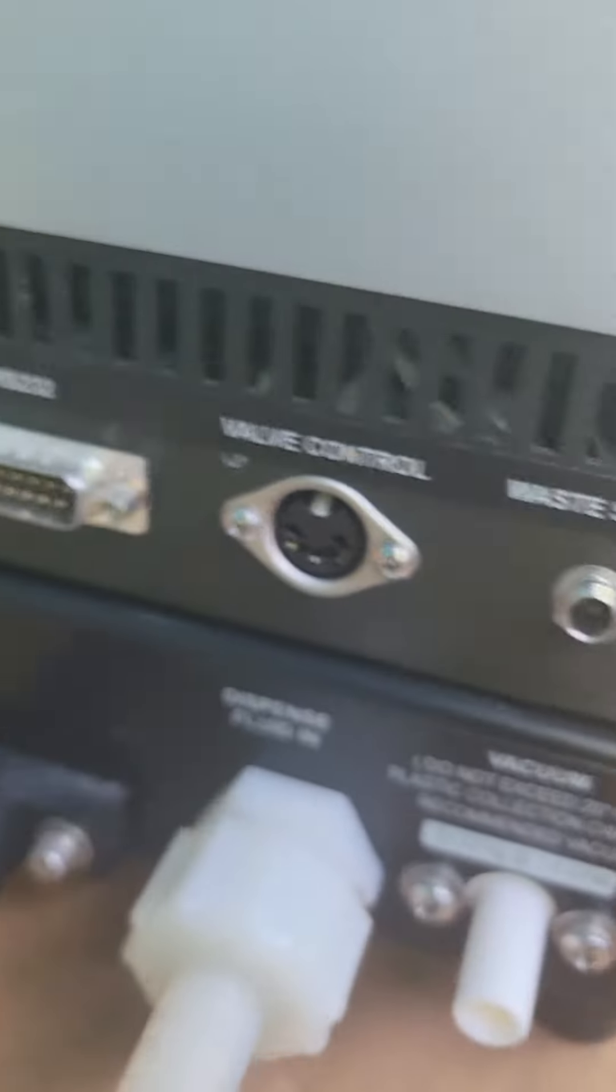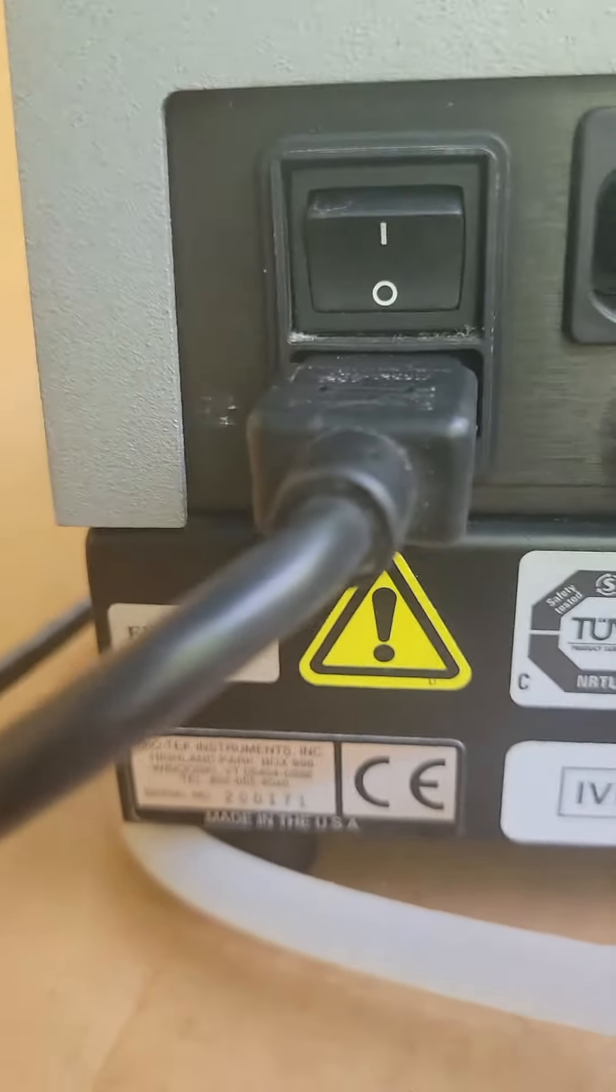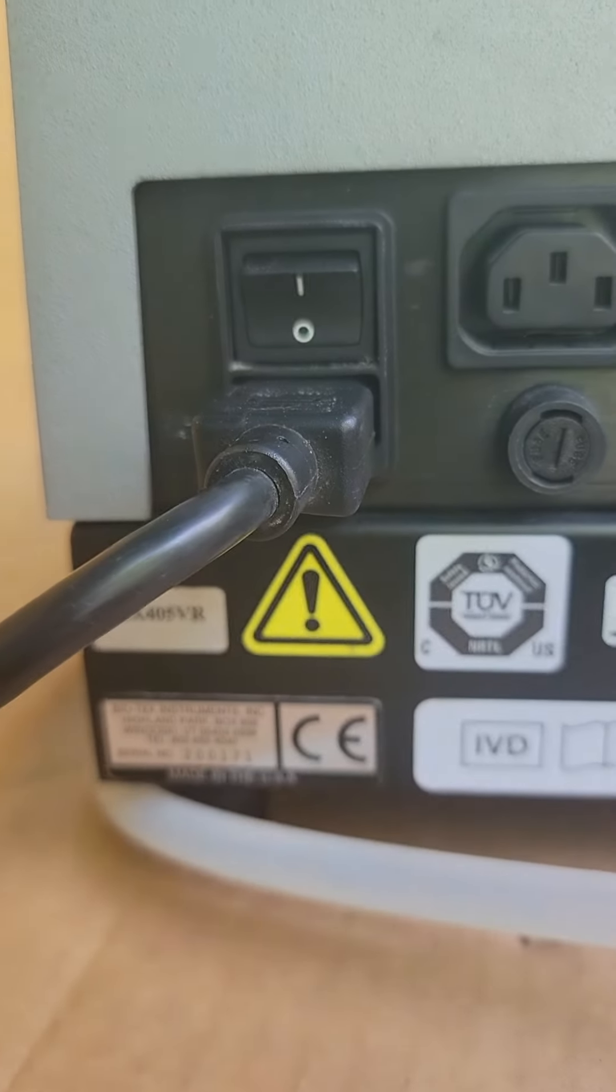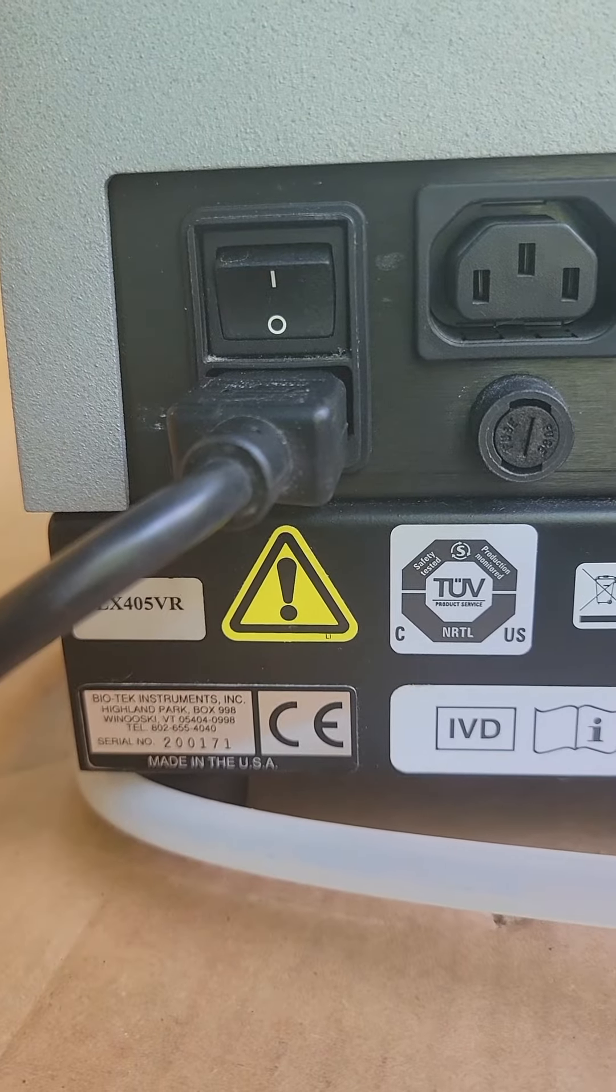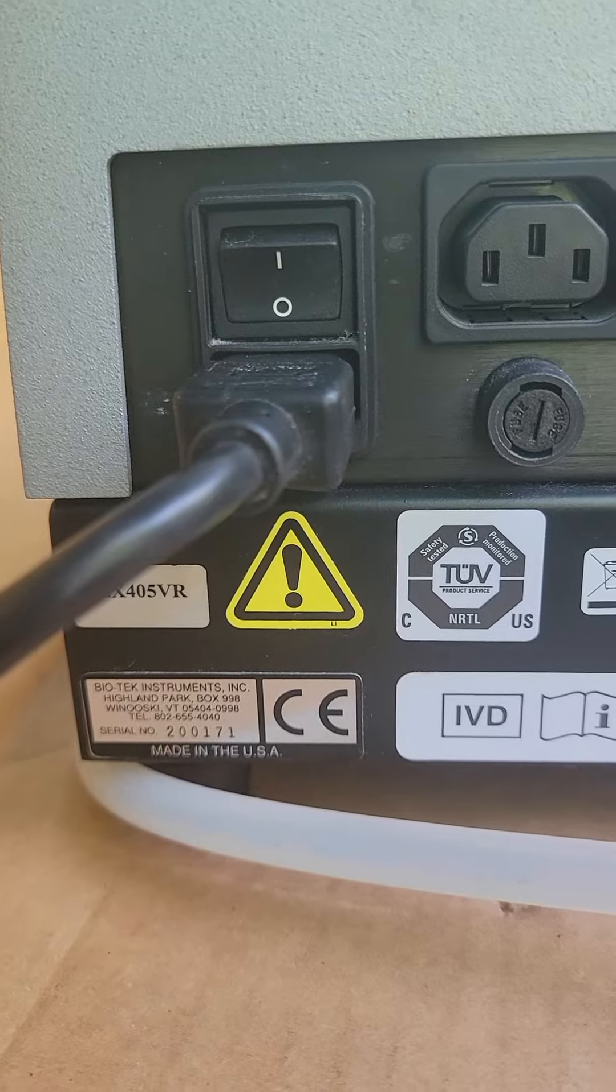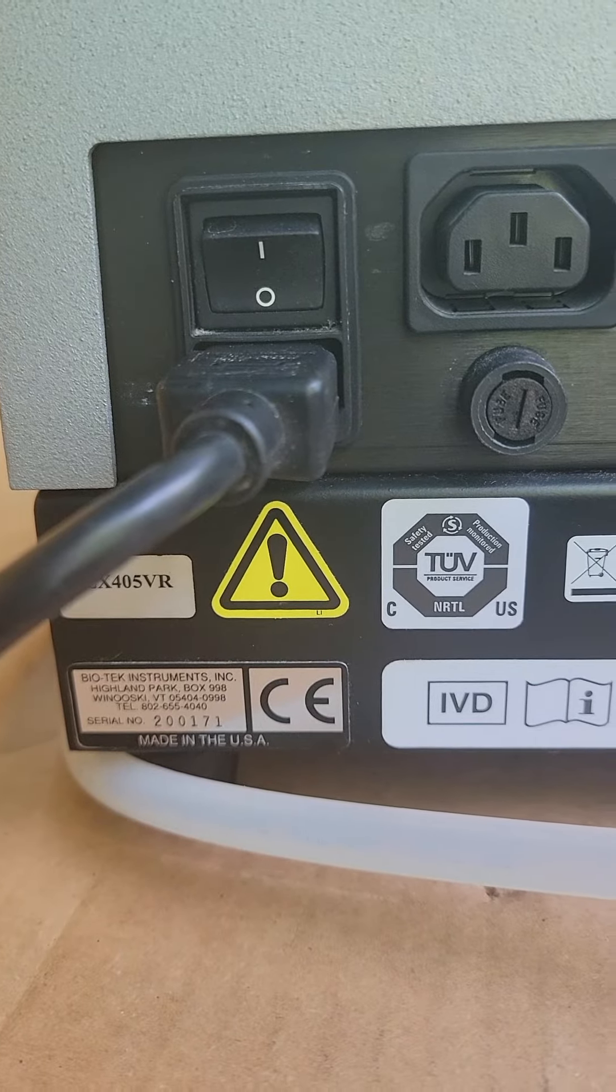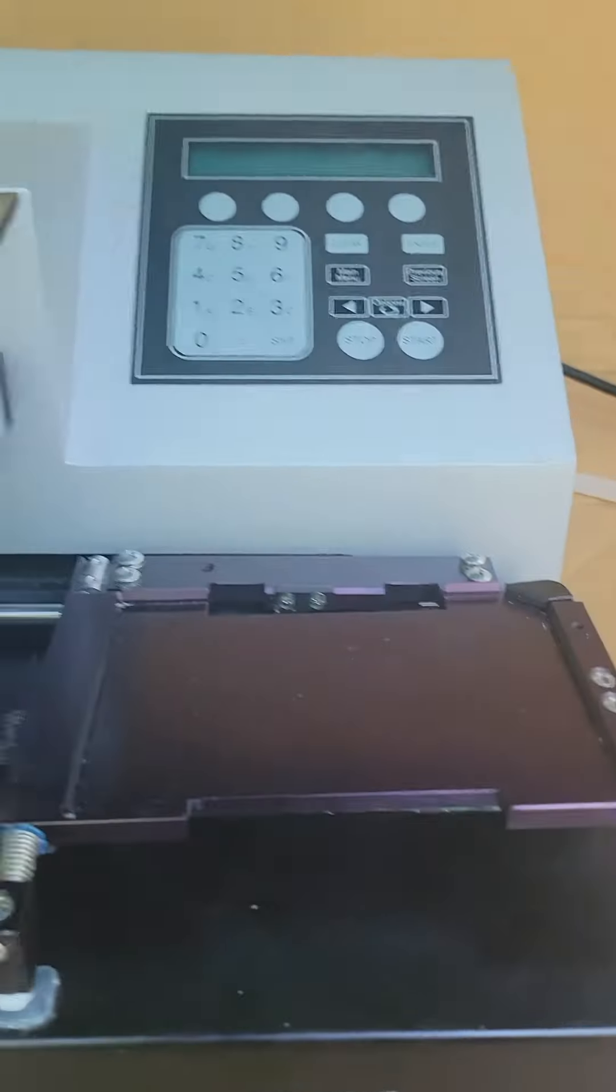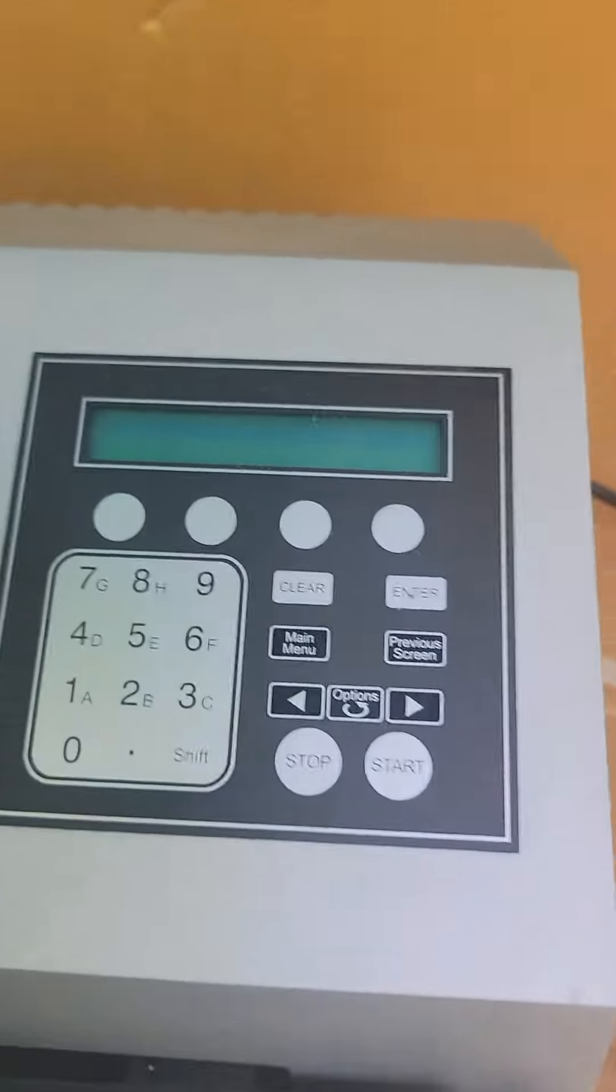And this unit does power up and does work very nicely as well, as you can see. And it's an ELX 405 VR. So let's power this thing up and see how it works.